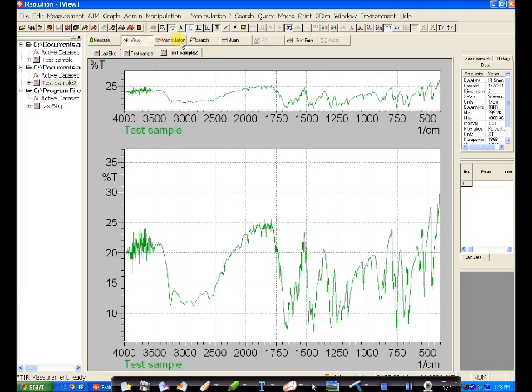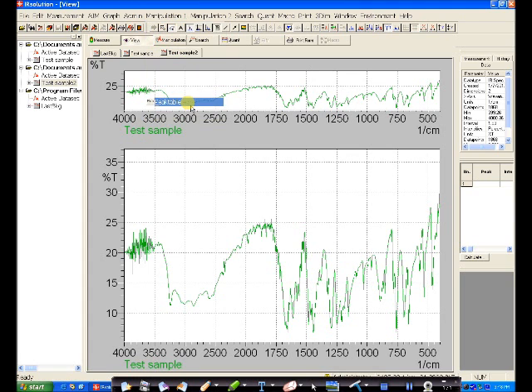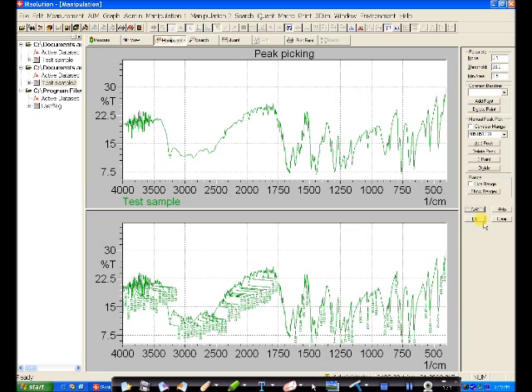We are going to do peak picking for a start. Go to the top row of tabs, click on Manipulation 1, scroll down to Peak Table, and left click. Now on the right column, you see the parameters for noise. You can leave it at 0.1 threshold, 30.0 minimum area, or adjust it to 0.5. You can play around with these depending on how sensitive your peak picking is going to be. After you're satisfied, go down a little bit and click this icon, CALC, which stands for calculations.